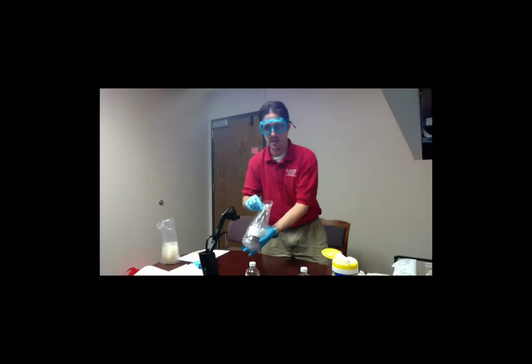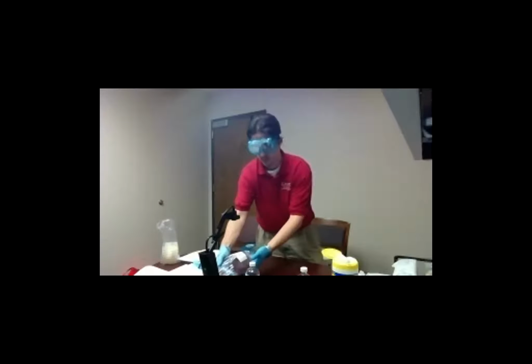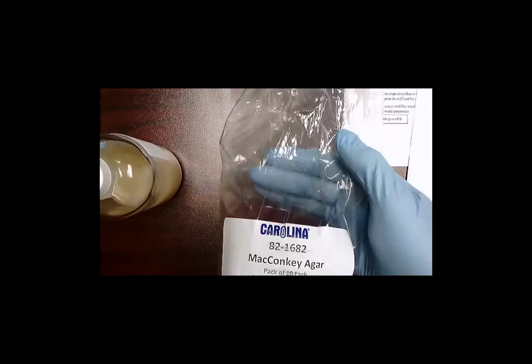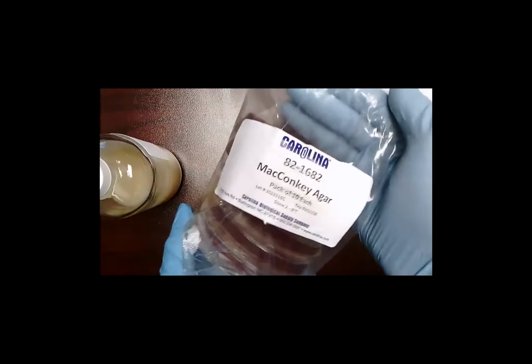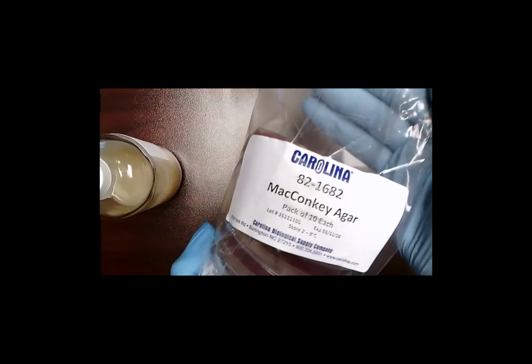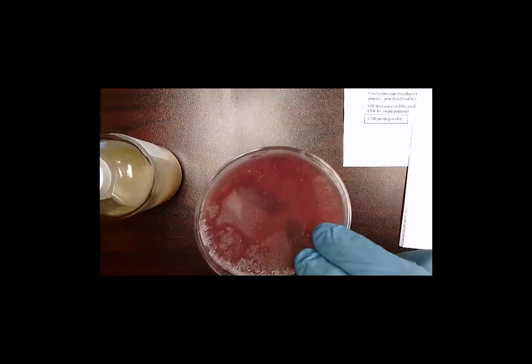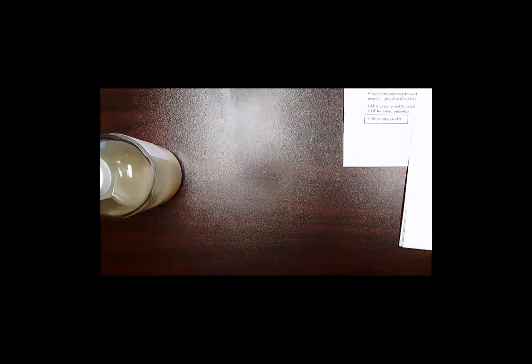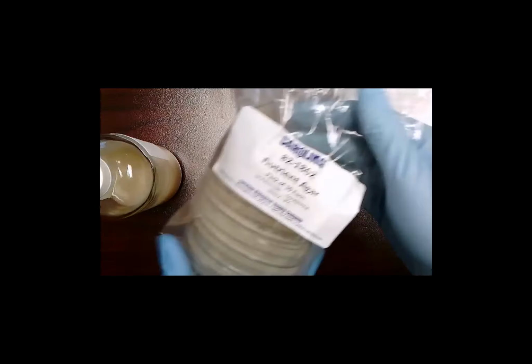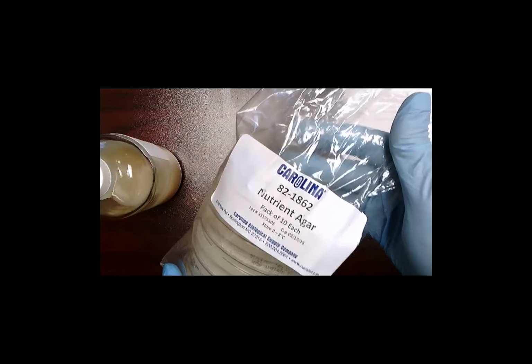Matt, can you show the camera for them? Yep. There we go. So you can order them from Carolina. You can order a package. They come in packs of 10. This one is MacConkey agar. How you can tell that is MacConkey agar is this purple, red color, the dark one. And then let me show you the nutrient agar. These, I believe, are about $21 a pack of 10.